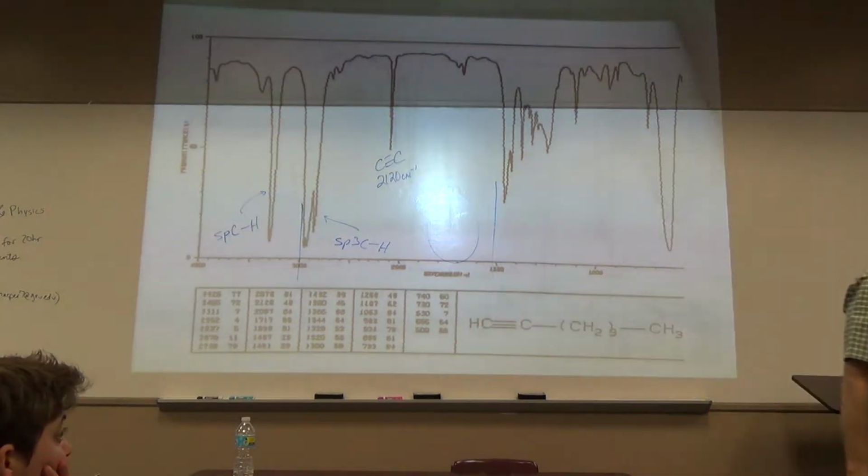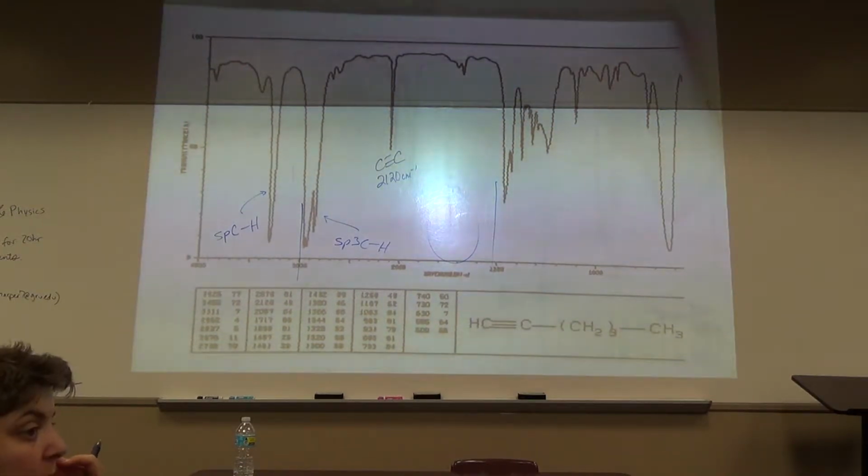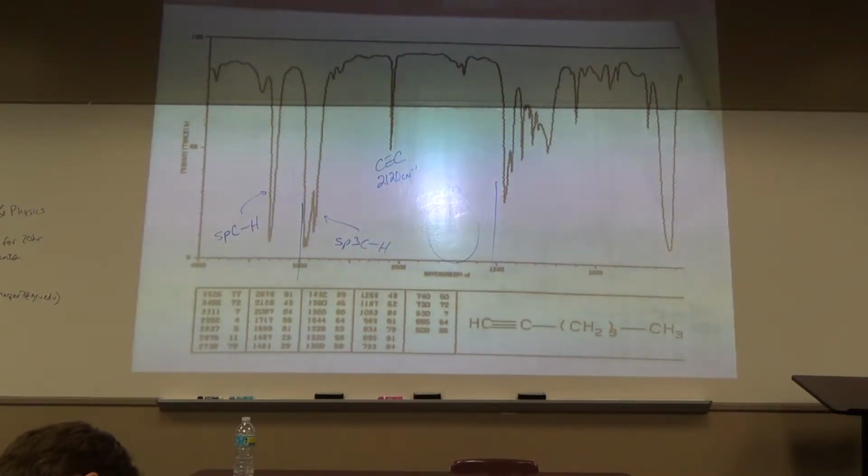Anything else? So there always seems to be this extra, whenever you have the sp3ch's, this one here and all of the other ones, is that from the sp3ch's that have carbons on one, or CH3s or CH2s? I don't think anything of it. It might just be coincidence in those. You have to see if it keeps looking like that.